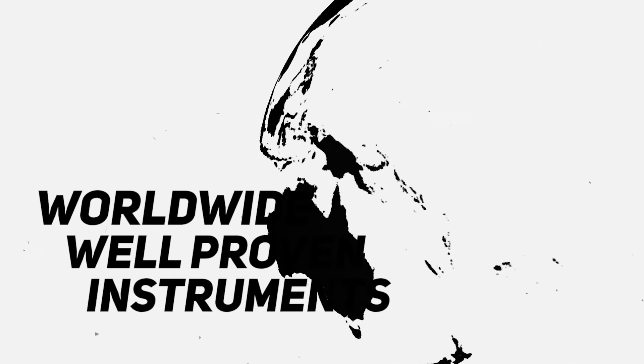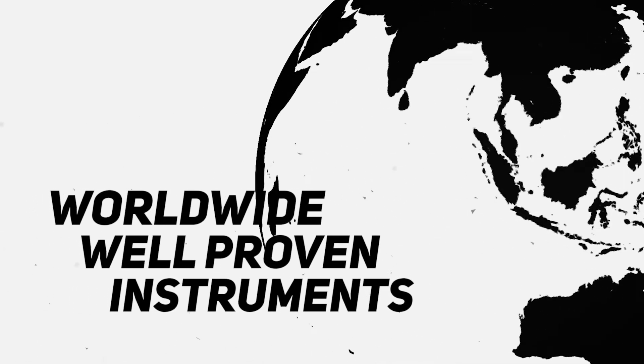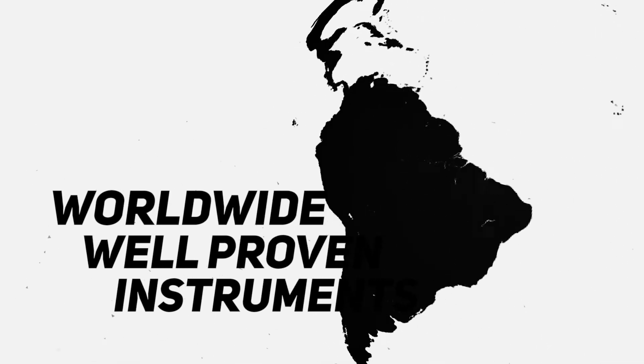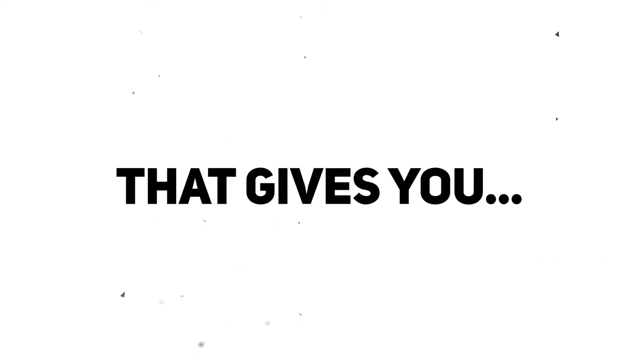BPC Instruments' analytical systems have been sold and validated by labs and researchers worldwide — more efficient, reliable, high quality research and analysis, leading to significant reductions in time consumption and labour requirements.